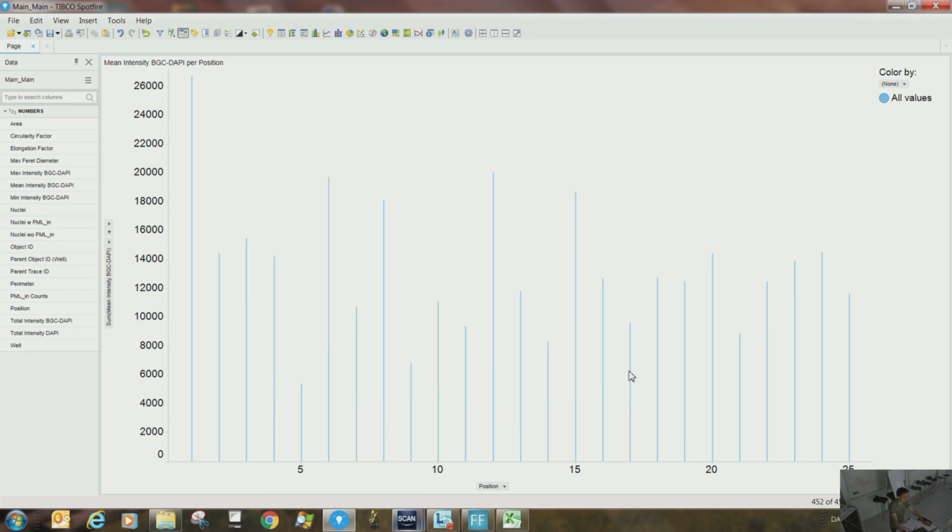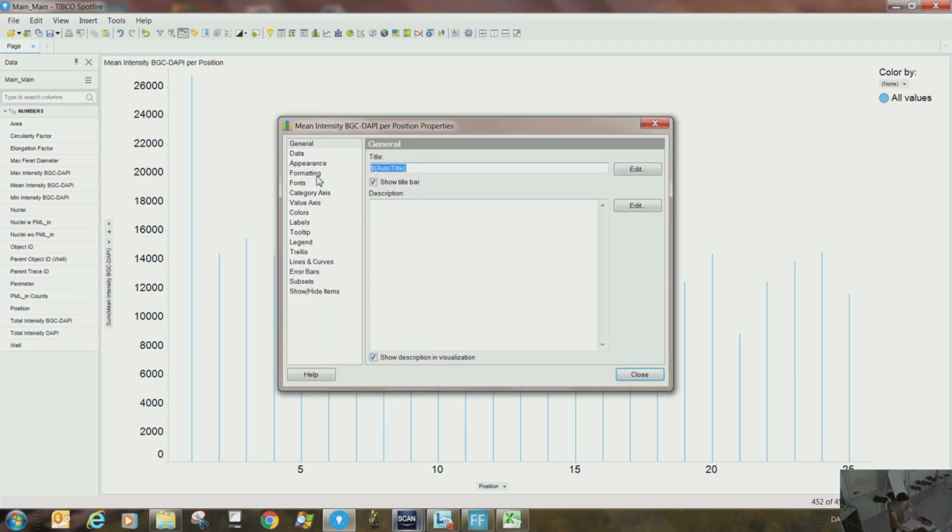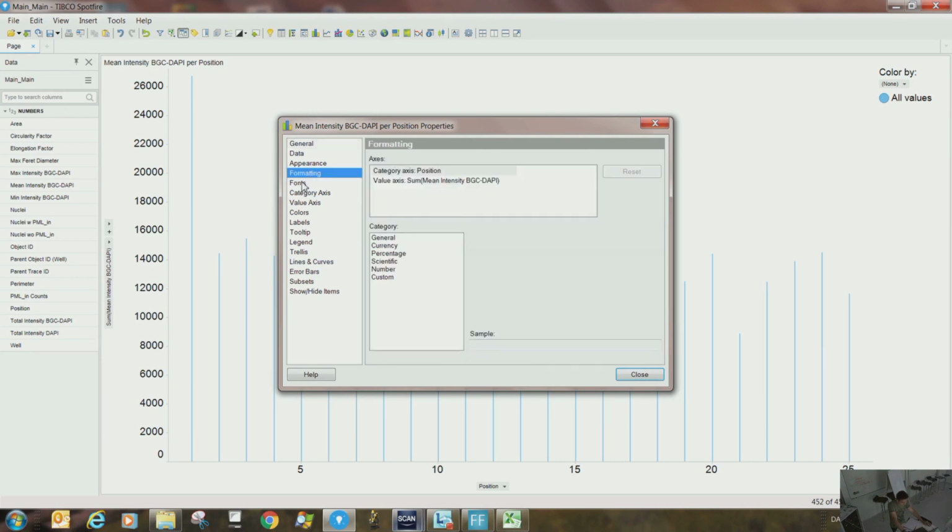But there is a possibility of sorting with respect to values. So it goes from decreasing order, or you can change it from increasing to decreasing order. Right? Okay. Yes, that's also possible. So this is about the formatting.